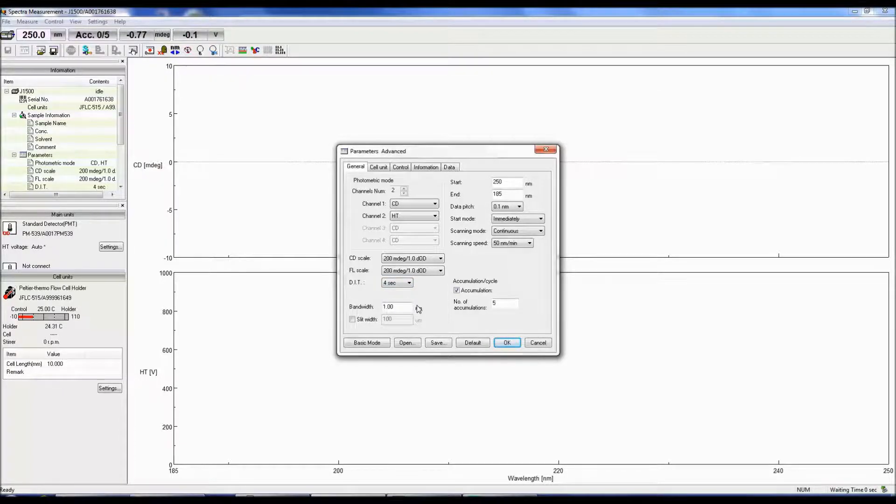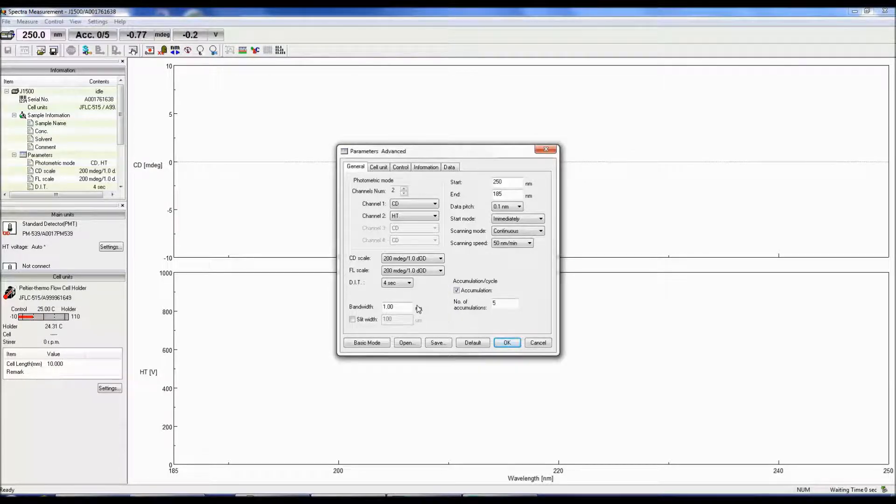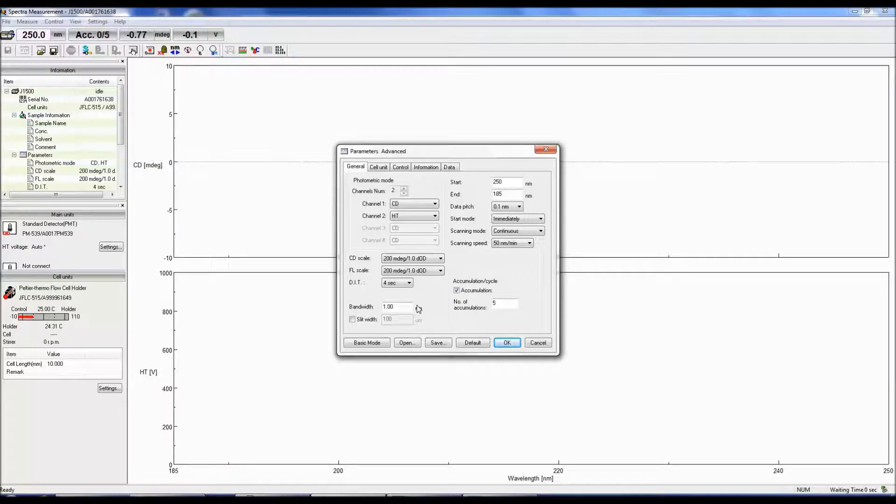The bandwidth determines how much light reaches the sample. The smaller the bandwidth, the less light throughput and the lower the signal to noise, but you can achieve better peak resolution.